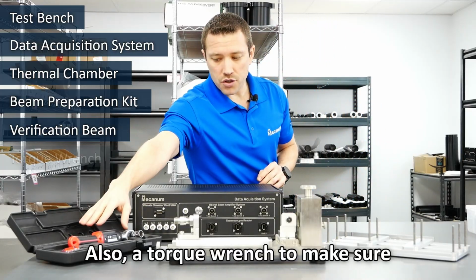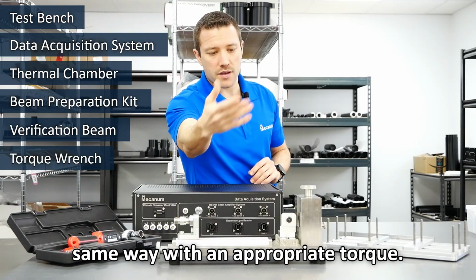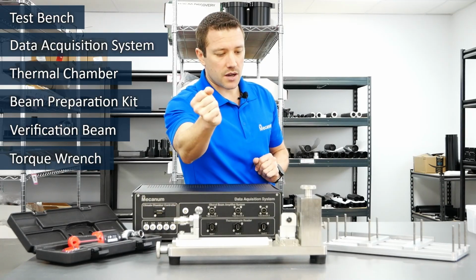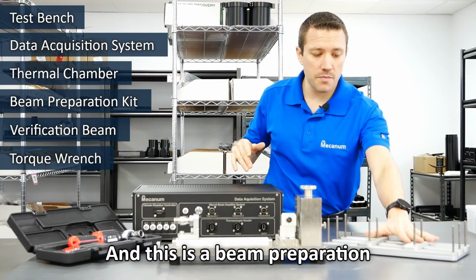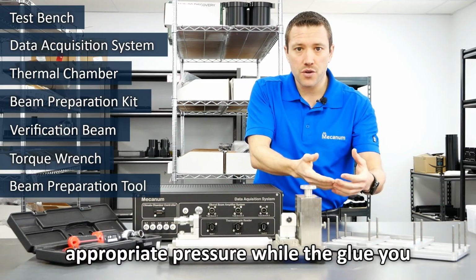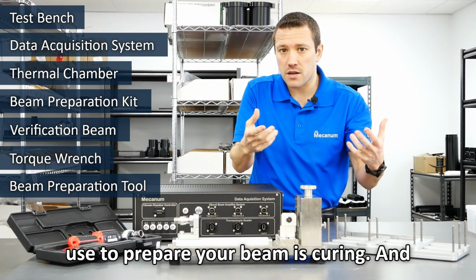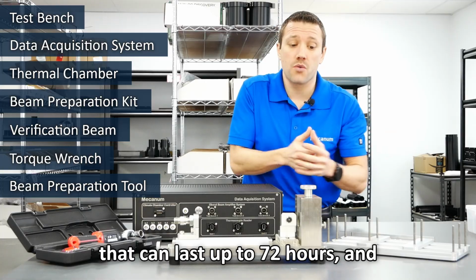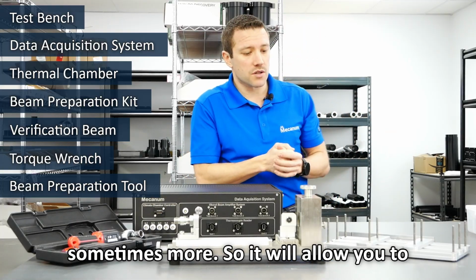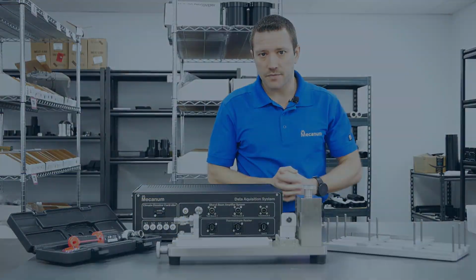Also a torque wrench to make sure that you always install your beam the same way with an appropriate torque. And this is a beam preparation tool to make sure you apply an appropriate pressure while the glue you use to prepare your beam is curing. That can last up to 72 hours and sometimes more. So it will allow you to increase the accuracy of your test.